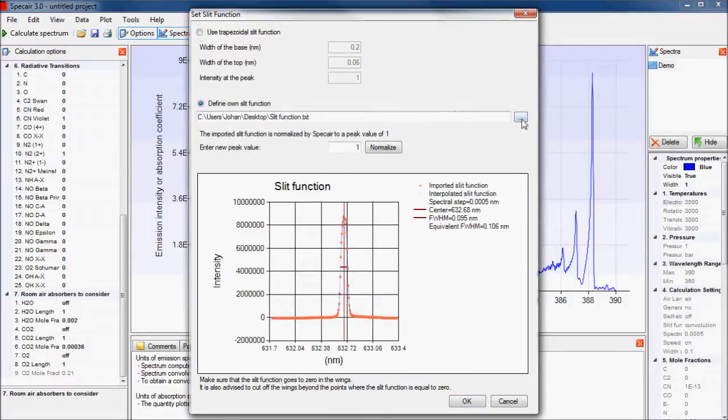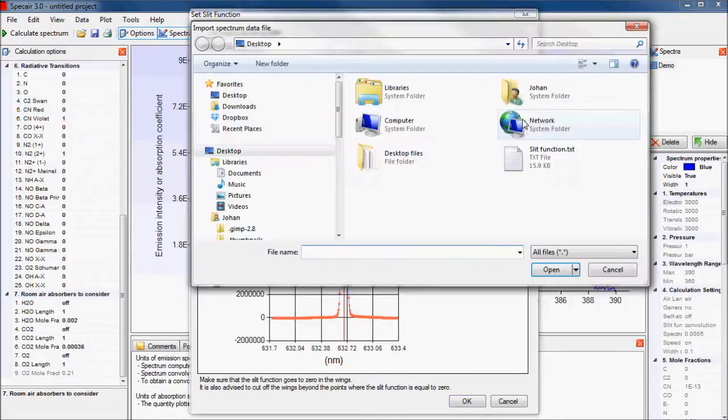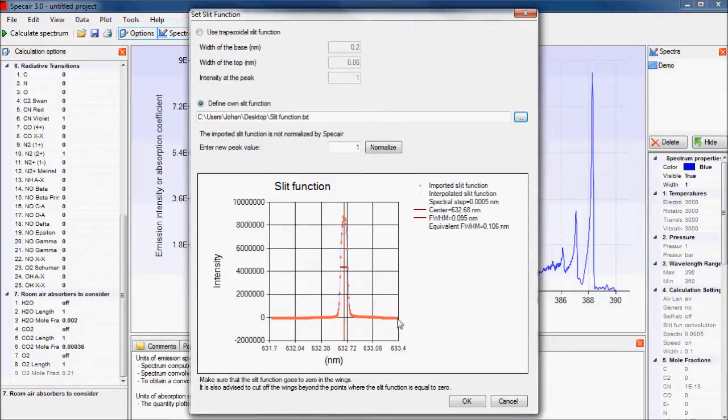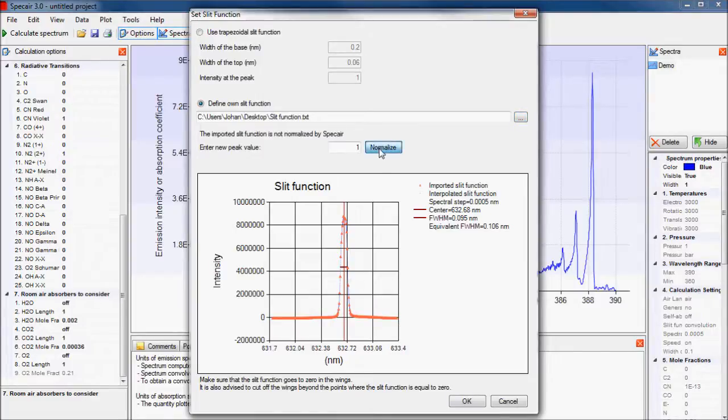If you use an experimentally determined slit function, make sure to cut data, such as excessive wings which can introduce anomalies during convolution. To get the right units, it is also necessary to properly normalize the slit function.